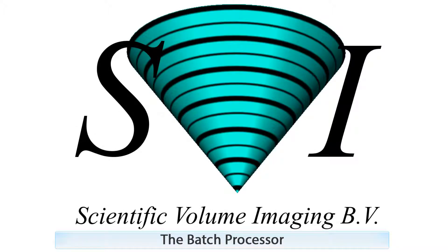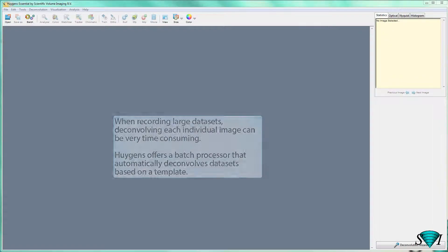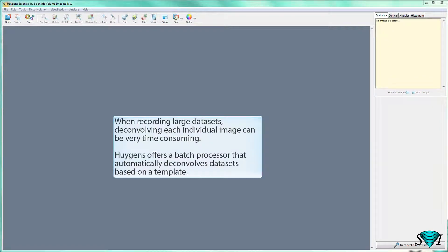The Batch Processor. When recording large datasets, deconvolving each individual image can be very time-consuming. Huygens offers a Batch Processor that automatically deconvolves datasets based on a template.